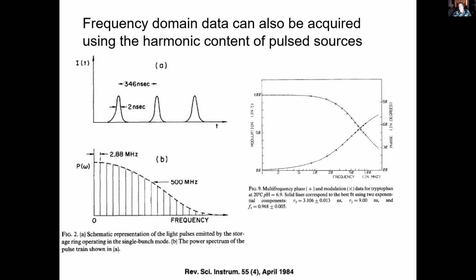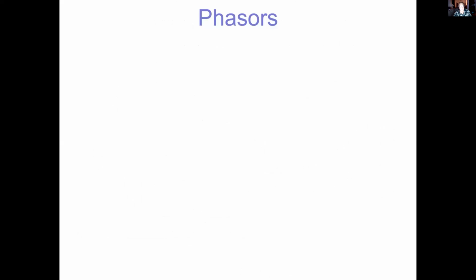In fact, in laboratories such as Enrico's, he has a number of FLIM microscopes. I don't know how many now, but a lot. Some do time domain pulses, and some do frequency domain. As an operator of the instrument, and maybe you'll see this, you don't care what it is. You just get the lifetime. It's all the same. Well, now let's talk about phasors.